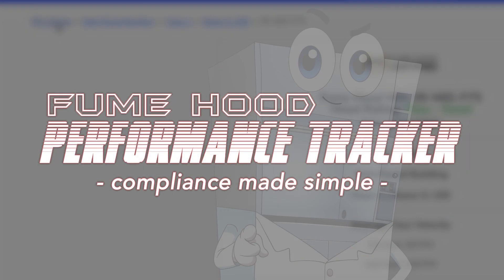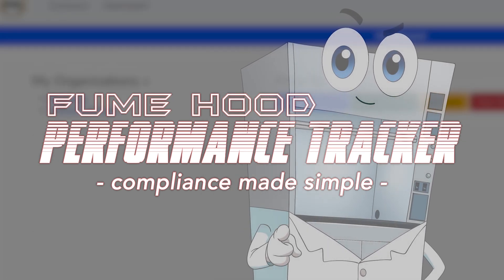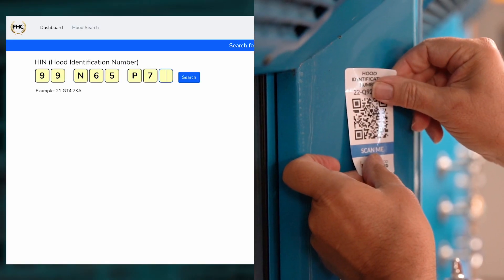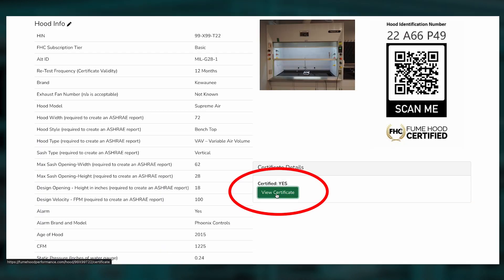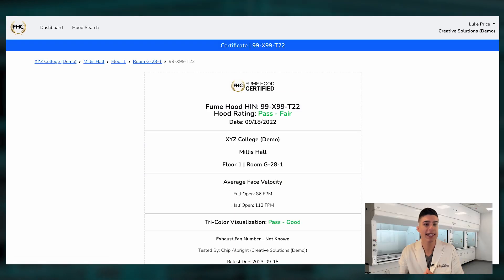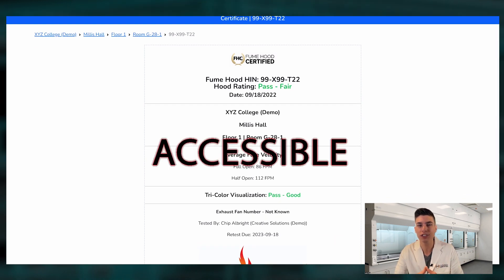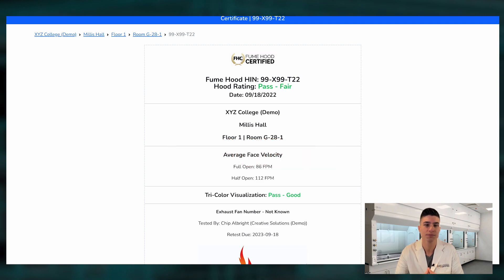Welcome to a quick walkthrough video of our new software called the Fume Hood Performance Tracker. This software is an invaluable new tool for fume hood testers and lab managers. It allows them to create an easy-to-search online database of fume hoods and their safety test results. This makes compliance easier, test results more accessible, and it's a more efficient solution than anything on the market for testers.